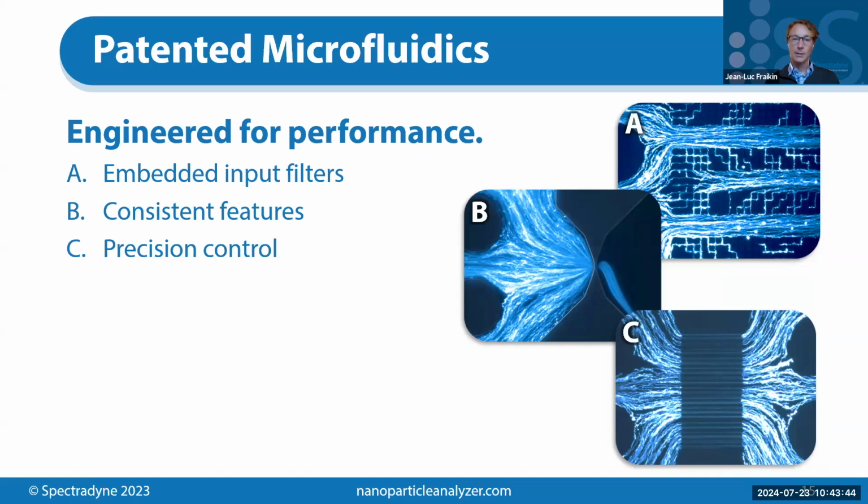Okay, there's a question about double labeling: particles should be showing in yellow color instead of red in the fourth quadrant if both single labeled are green and red. Yeah, so the colors in the plots I showed are really just an artistic impression. They're just chosen for aesthetics, so they're not the actual colors of the particles that are being detected.